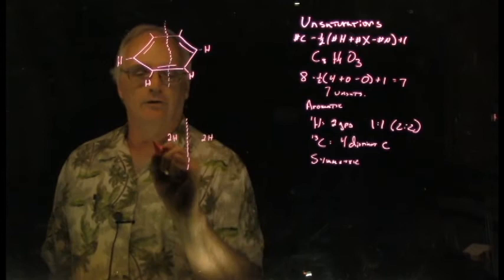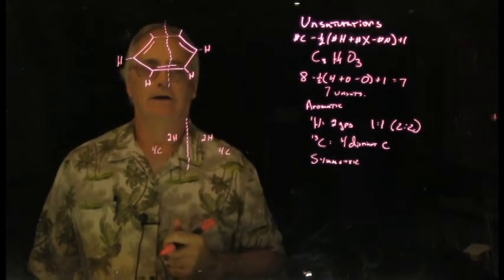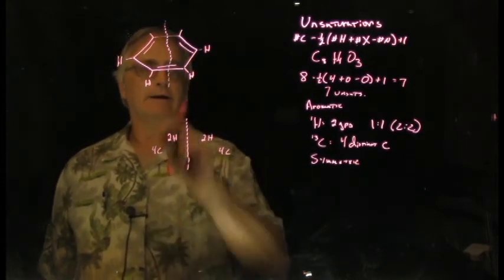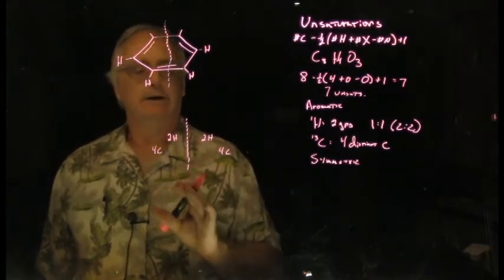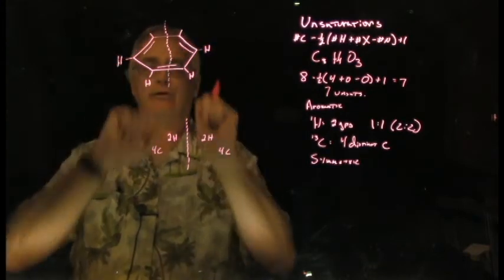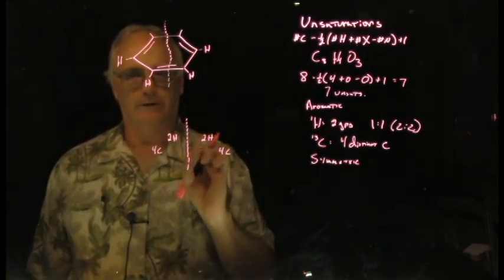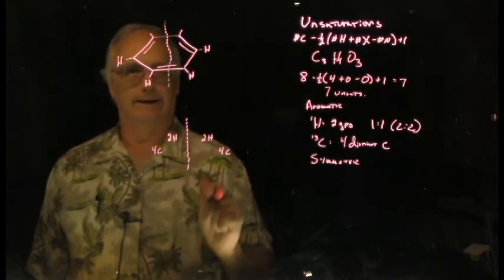That there are also 4 carbons on each side of this mirror plane here. Now, look at it carefully. This that I know I'm certain about gives me 3 out of the 4. Okay, I get 1 group here, 2nd, 3rd group. But there must be a 4th group of carbons that are on opposite sides of the mirror plane here.